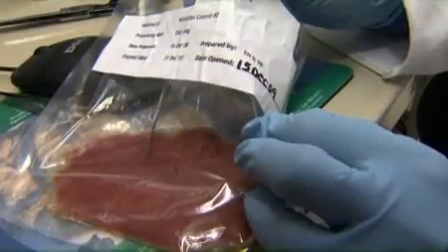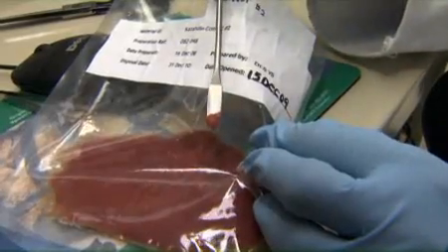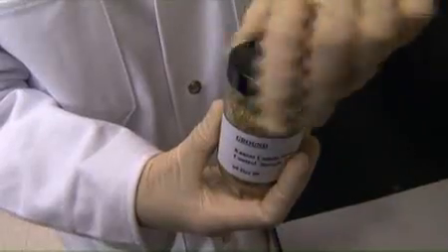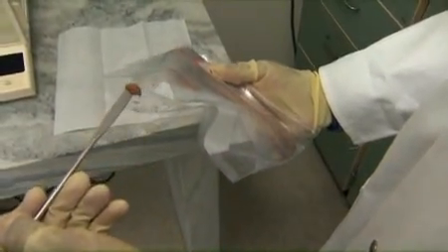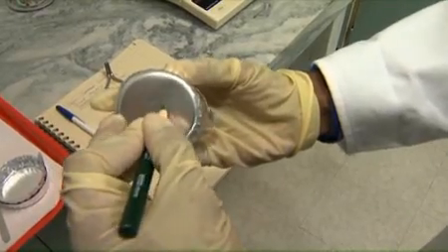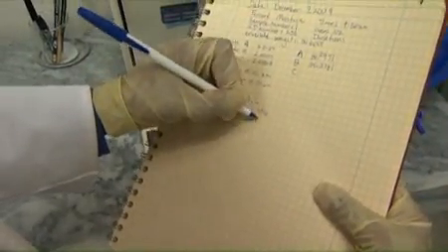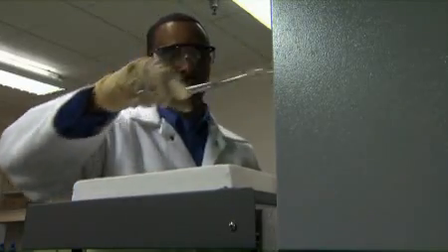We urge you to determine what specific good laboratory practices and particular safety requirements are necessary for your own applications. Recommended guidelines include: maintaining sample integrity by limiting exposure to air and non-suitable storage temperatures; wearing gloves when handling samples to prevent cross-contamination, as oil, moisture, or other material on bare hands can affect sample integrity and result in inaccurate data; keeping samples clearly labeled from preparation to disposal; recording observations at the time they are made; and exercising safety precautions at all times.